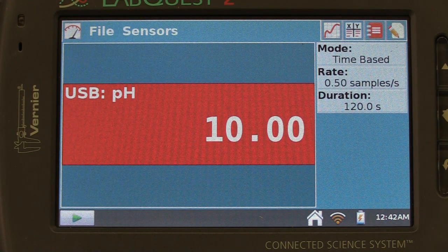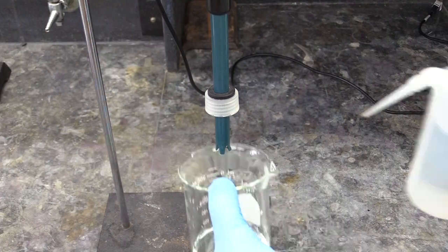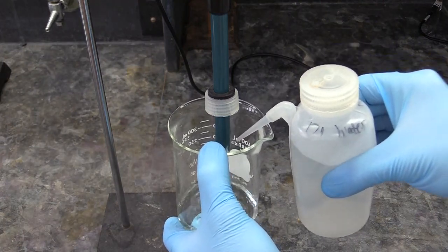Your probe is now calibrated and ready for action. When you're done calibrating the probe, rinse its bulb off with more DI water.